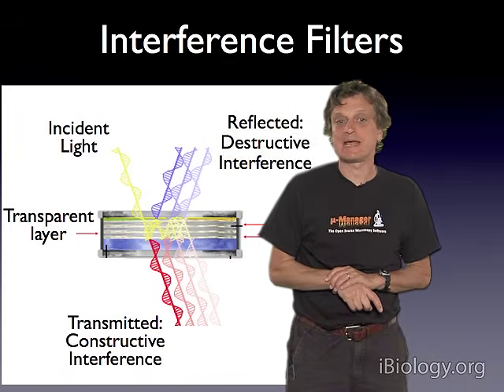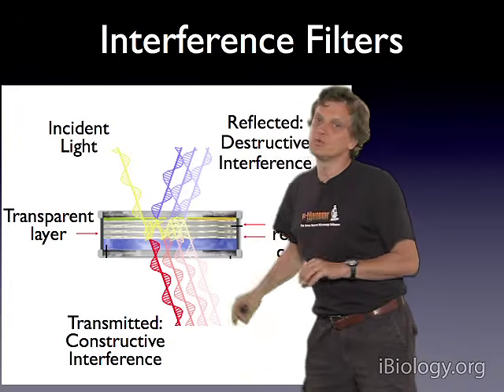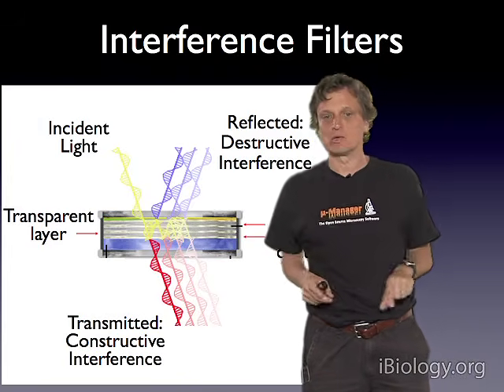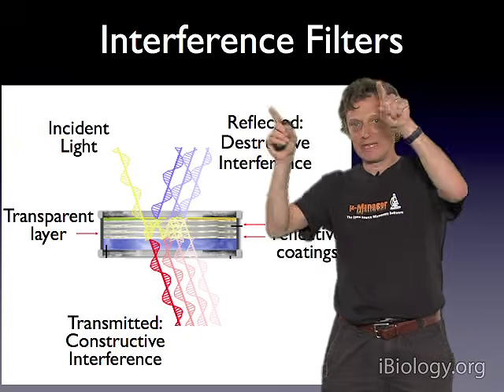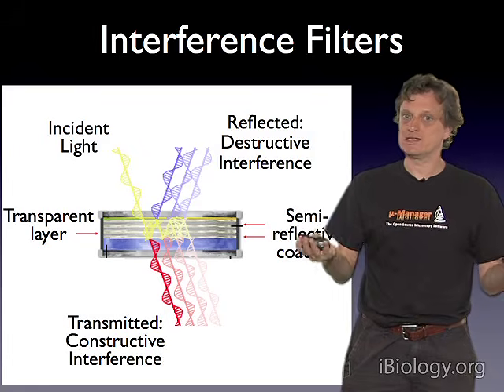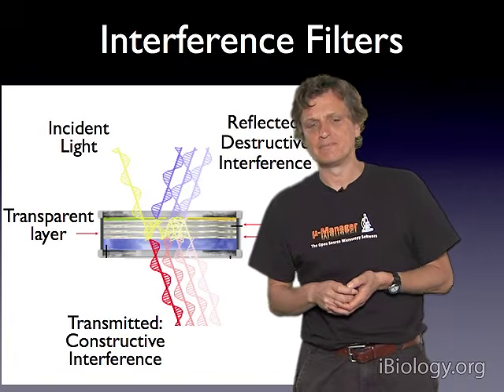Now the filter manufacturers can completely compute how these layers will behave, so they can design in the computer what wavelengths this filter should pass through and what wavelengths should be reflected. And you can basically order any type of filter that you may possibly need.